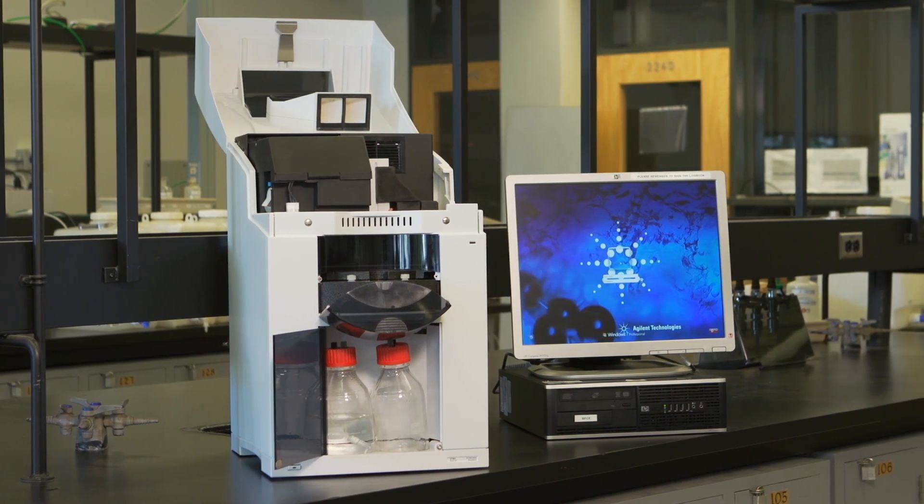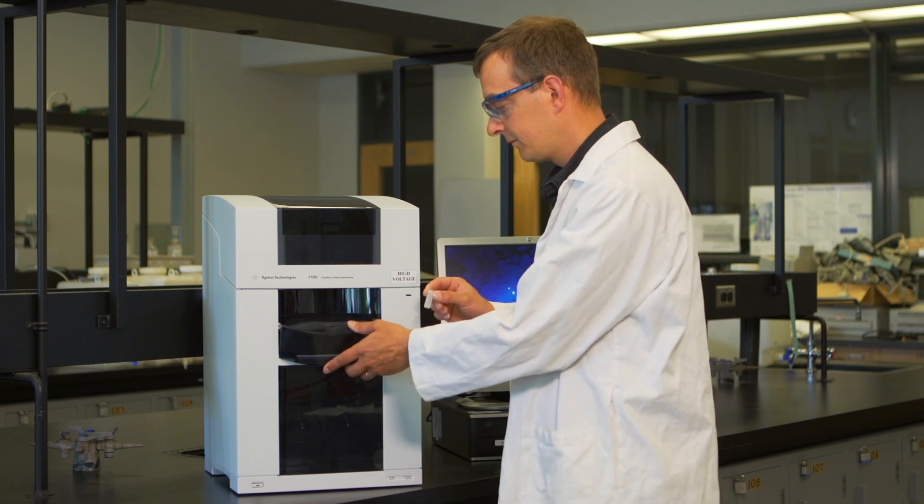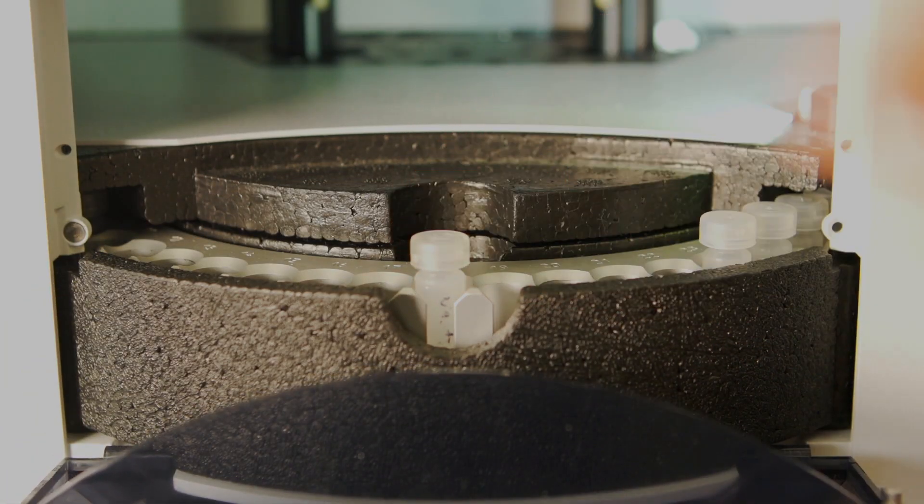We'll first look at the sample introduction part. The sample and buffer solutions are held in small vials that are placed into the sample tray.